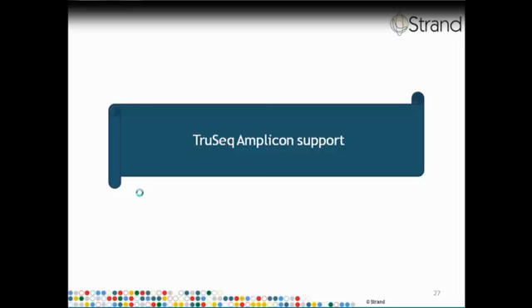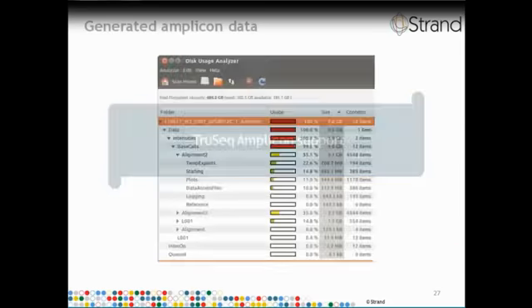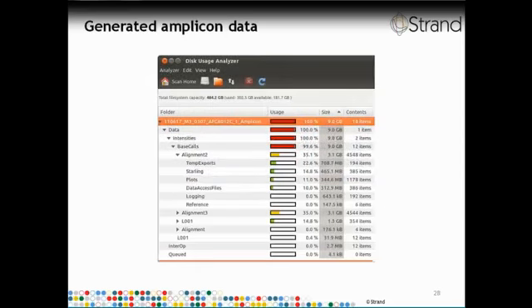Once we click on finish, the data is loaded into a DNA variant analysis experiment. The files loaded are almost exactly the same as the resequencing experiment we discussed earlier. It loads the alignment files, the SNP, and the indel results. The center panel shows Genome Browser with one track for each of the 96 samples. So you can see the scroll bar indicates a lot of aligned read samples are present out there. It shows the dbSNP information and the transcript track.